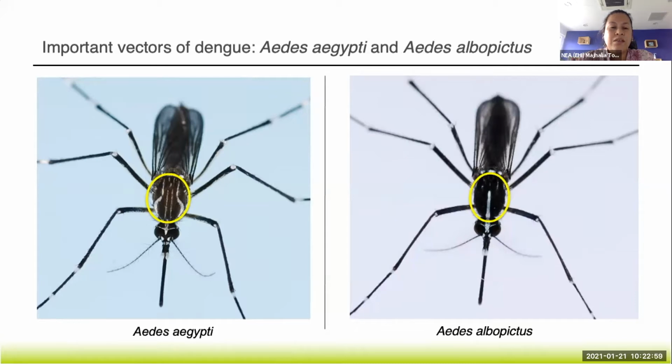When you have a sticky lining, many of these scales will turn black when they come in contact with the glue, or they just simply drop off. So there must be other characteristics you can look for when you want to differentiate between the two.